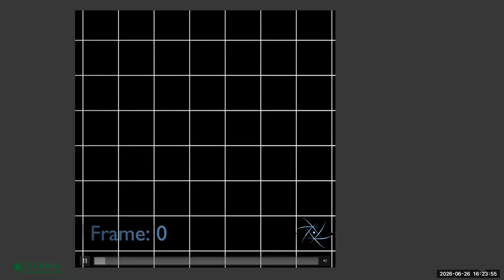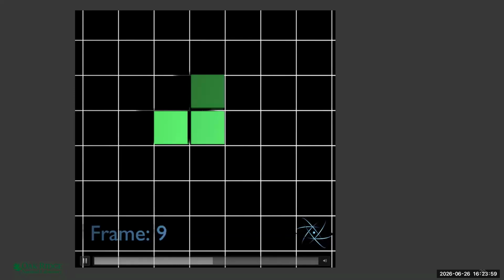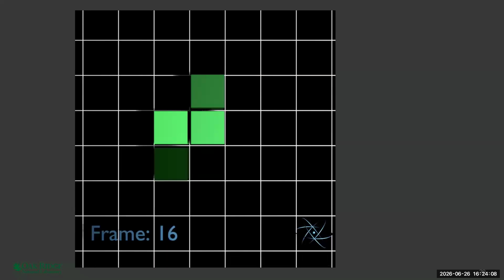So if I can start this movie, this one actually works. This is a single electron hitting the detector, and you can see it sort of splashes across a few pixels over some time interval. I think these are fast ticks, so this is some fractions of a nanosecond.